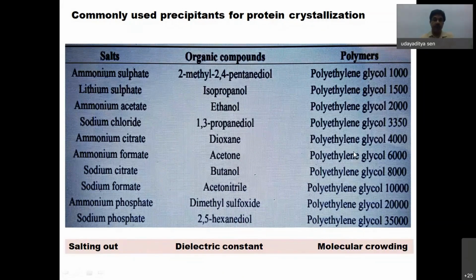So these three compounds act in 3 different ways. And what you can do, you can use a combination of these, but if you use this in high amount, then you have to use this in low amount, or this high amount, this low amount, because these two are not miscible. They are immiscible, so one has to be very low if you mix them up.